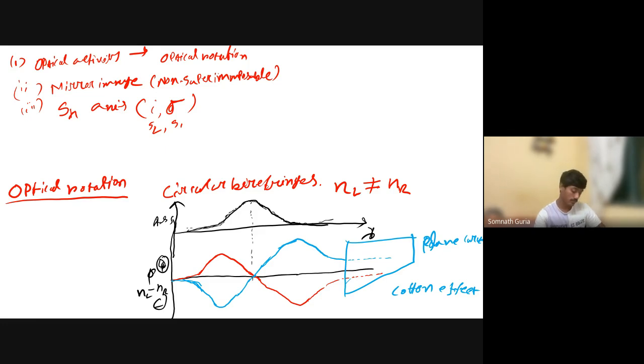Now, another interesting thing is that this effect is called, let's have a blue one, this is called the positive Cotton effect.